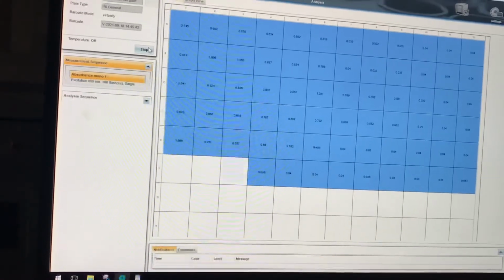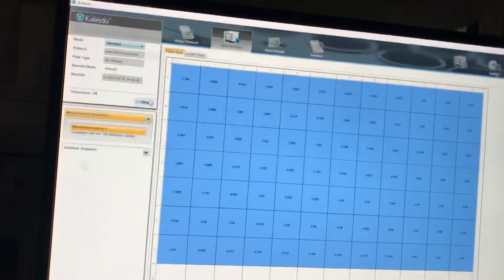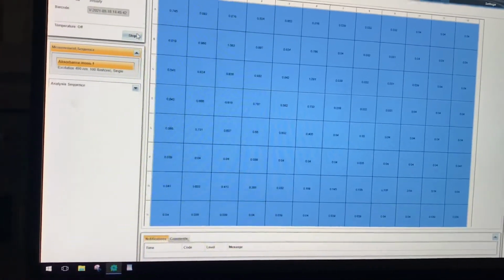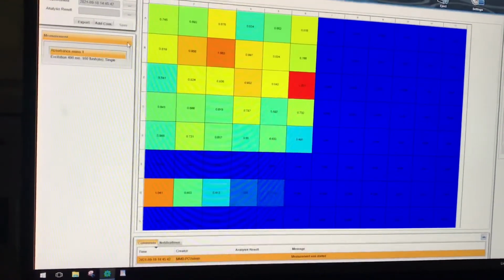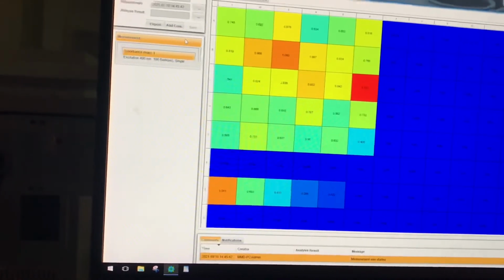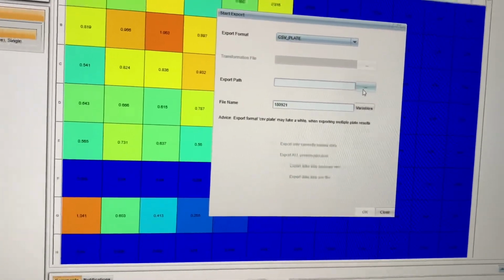By drawing the graph between the absorbance and the number of cells per well in your controls, we can find the R value, and by that we can find how many cells are there per well in our original plate, so that we can draw a graph of the proliferation among the various cell lines and how fast the cells are proliferating. Here you can compare the controls in the G row with the other cell replicates, draw a graph, and know how many cells there are.